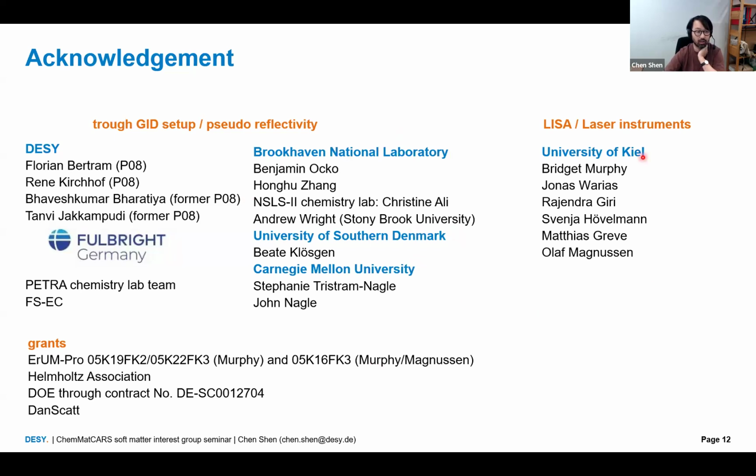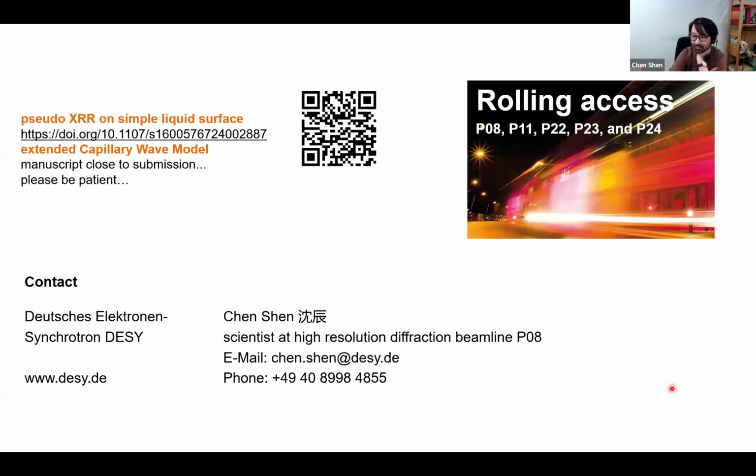Also, since I mentioned P08, we have a second liquid surface diffractometer, LISA, and also an associated laser instrument on top of that. And this is provided by Kiel University. Yeah, so that's it.